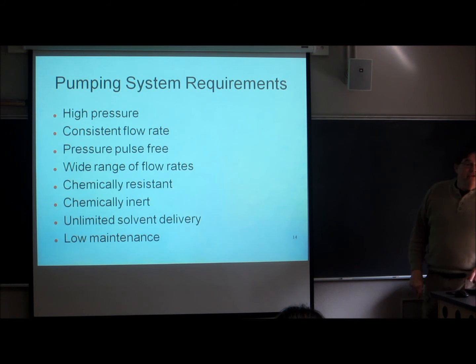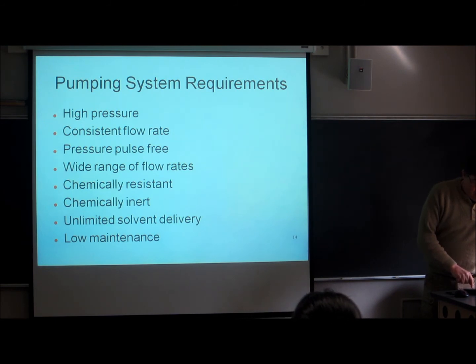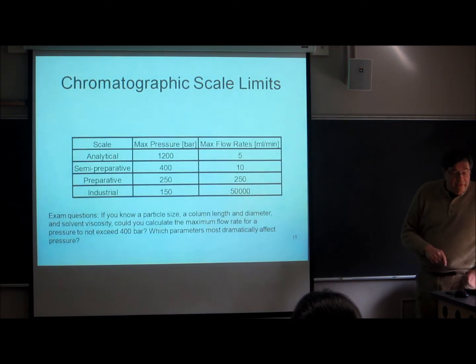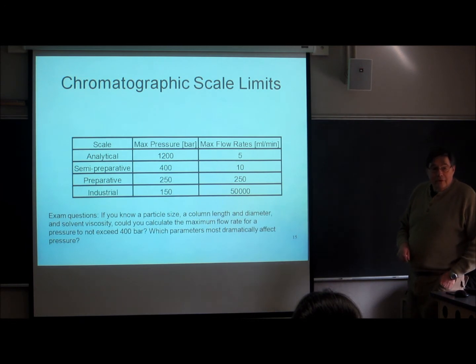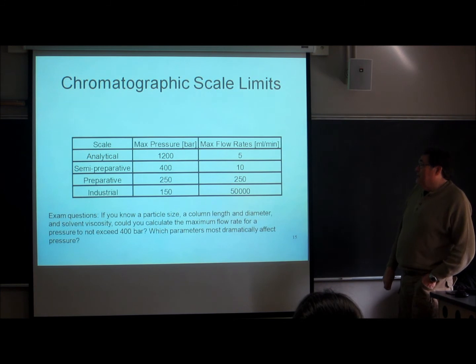They need to be chemically resistant. We don't want them dissolving in the solvent, right? And they have to be resistant to abrasion, to scratching, unless we're very careful getting particles out of the solvent stream. They also should be low maintenance. And one of the things, if you work in HPLC as a graduate student, you're going to learn how to maintain pumps, change seals and all that cool stuff. You'll win the Golden Wrench Award.